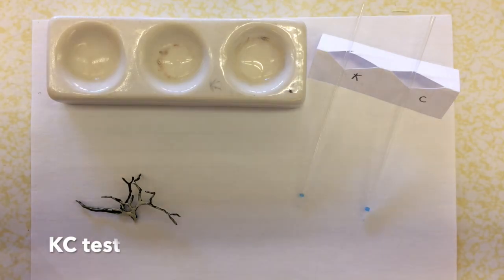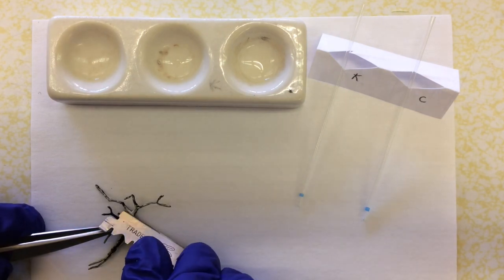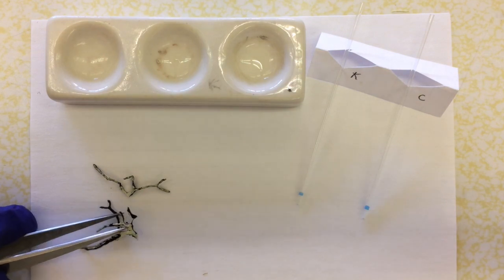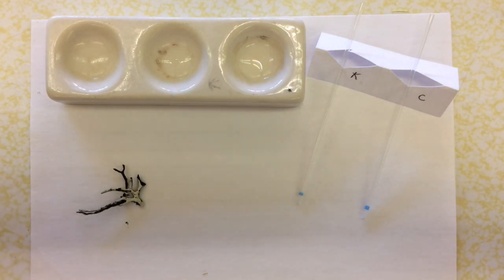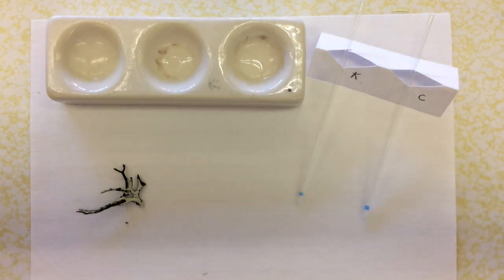The next spot test we will look at is the KC test. This test can be done by using glass capillaries or by using drops of the reagents on a piece of paper. However, the most important thing about this reaction is that you use K first and then C.